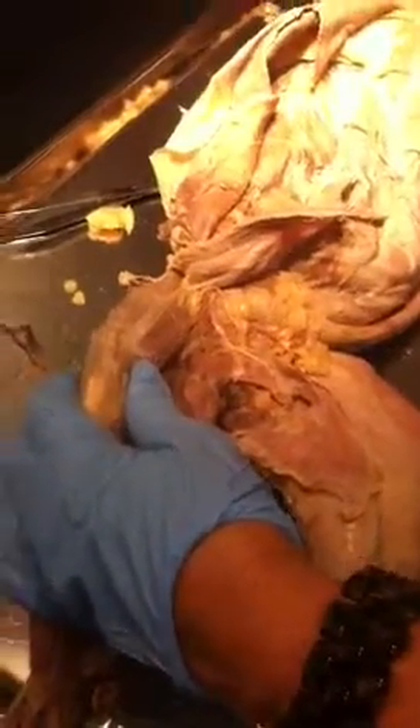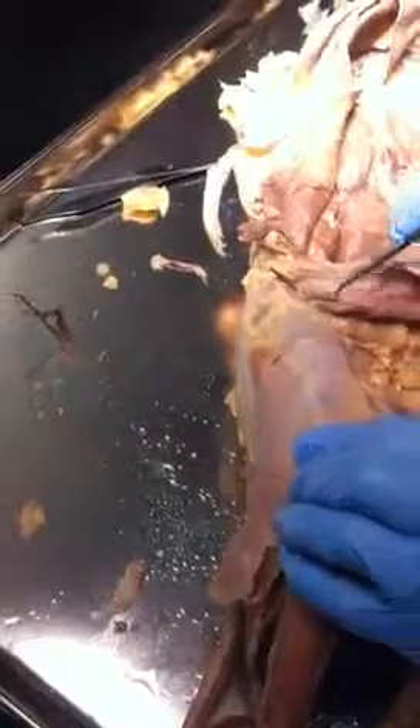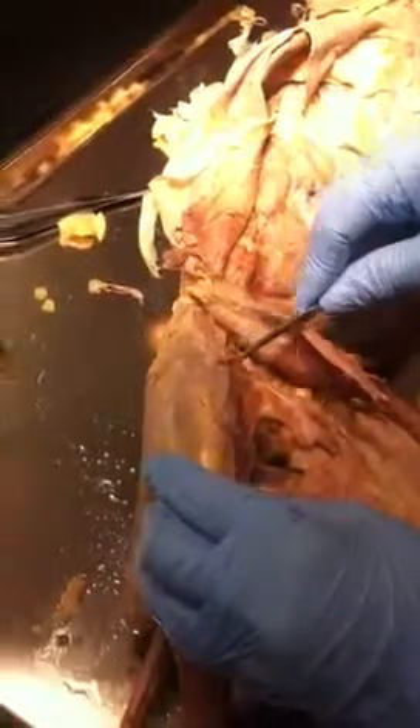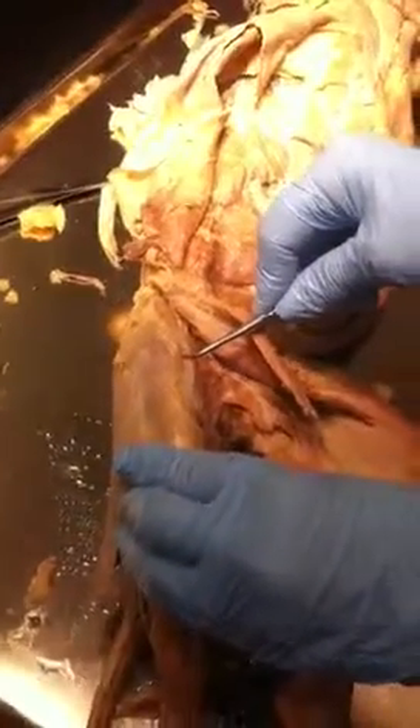Now guys, the reason it is important to remove that — this is vastus medialis. Do you see it on the medial side? That is somewhere here. This is vastus lateralis. And then in between you have rectus femoris. Prepare and call me back. And that's all we need?